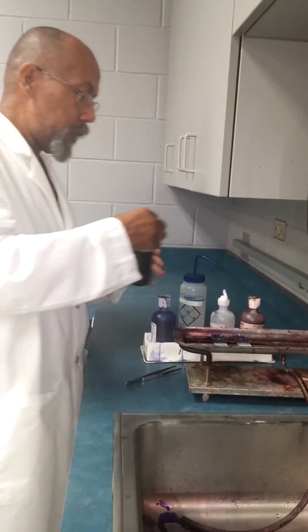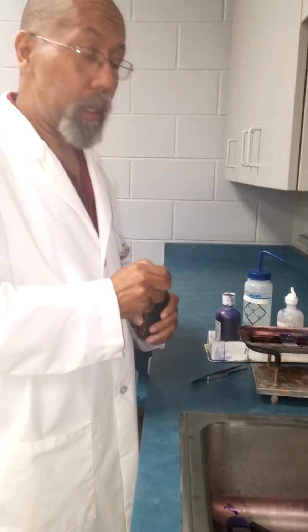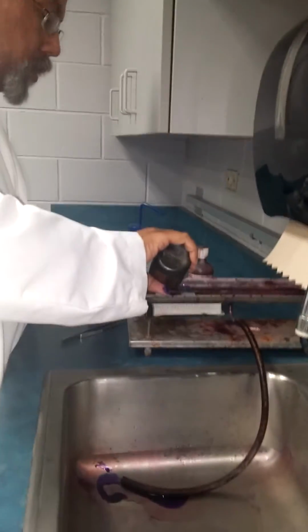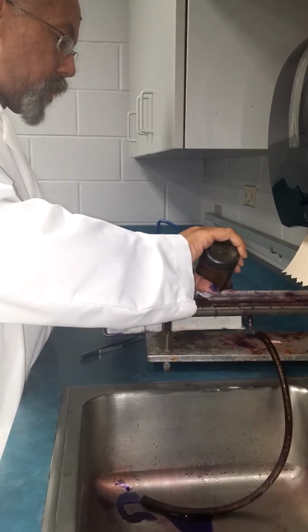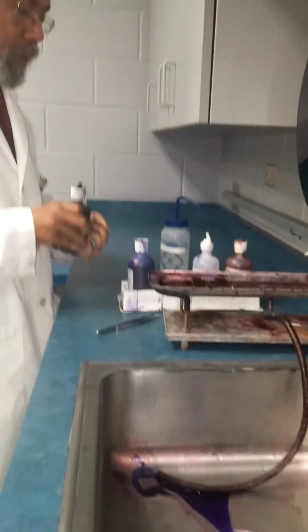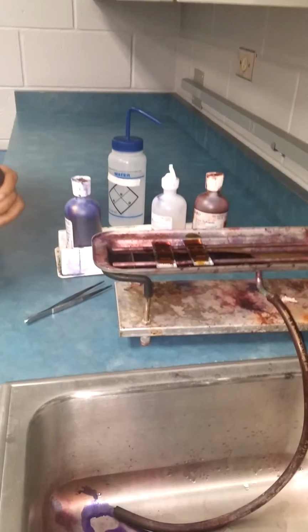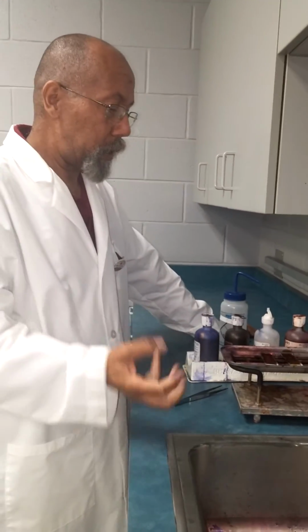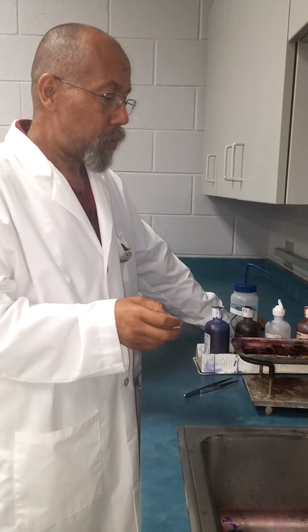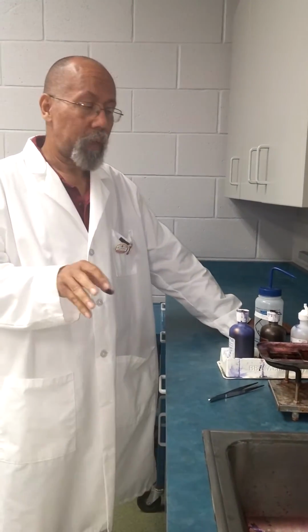Now we're going to add the mordant, which is iodine. And it also goes on for about 20 seconds. The purpose of the iodine, or the mordant, is to strengthen the complex that's formed between the cell wall and the crystal violet.